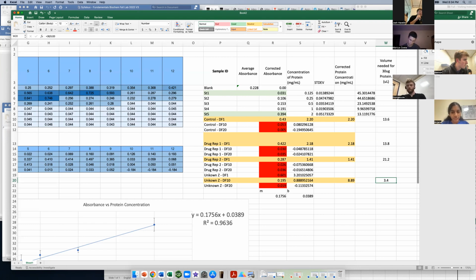Then what was used for the standards? They're the same standards we used last week. I think I used PBS. So there was no sucrose in those to give that extra signal. So the Wednesday lab, I remade the standards to include those things. So Wednesday can just do it as is.